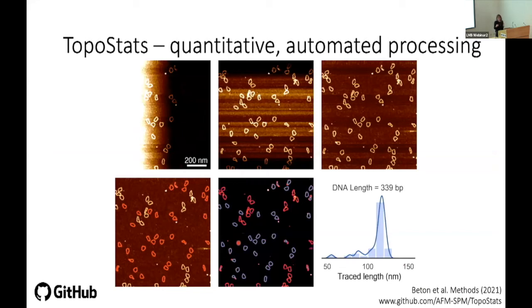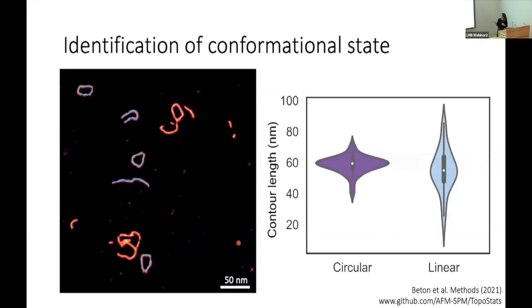we've got there. And AFM's maybe a little bit behind some of its microscopy friends like cryo and single molecule microscopy. So we don't necessarily have these tools. And this is something we're trying really hard to grow, because I think it's really where the field needs to be. It's quantifying these interactions. It's not just seeing them, it's quantifying. And so we're able to add a restriction enzyme and look at our linearized templates and say that they're the same length as our circular templates, but that we get an N of whatever. So we're able to look at the efficiency of that reaction.